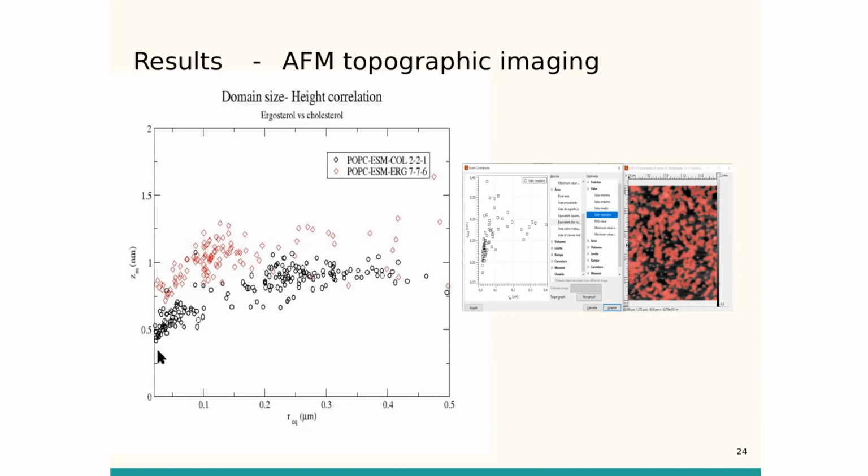But we are around here. When we do the numerical simulations, we are in very small domains, simply because we cannot make very large systems in the simulations. And when we are doing the AFM, we are around here. See? So we understand now that we cannot get this very large difference simply because we don't have enough scale in the simulation.